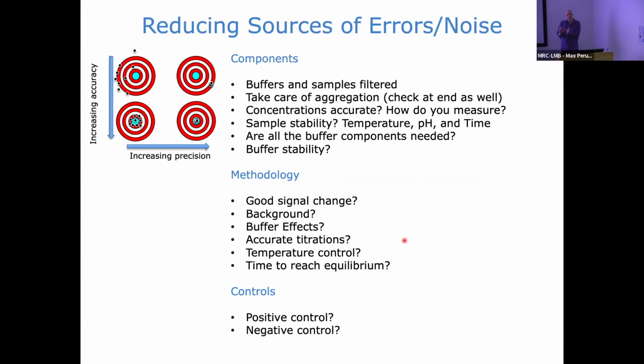Temperature control is something that people really avoid. You've got a plate in the plate reader and you push it in. I remember a case where a PhD student was not getting reproducible results. And it's like, well, what's happening? She's doing the same assay, same proteins, proteins she'd even stored. One was done in winter and one was done in summer. And of course, the instrument she was using wasn't actually controlled. And in the building we were in there wasn't air conditioning like here. And so the whole experiment was being run at about 10 degrees different temperature.